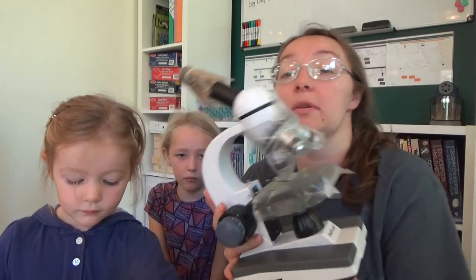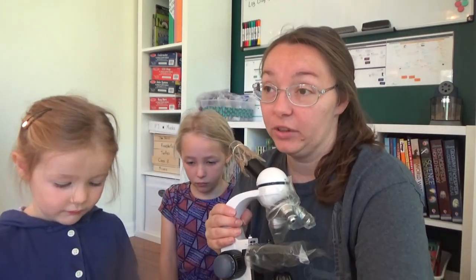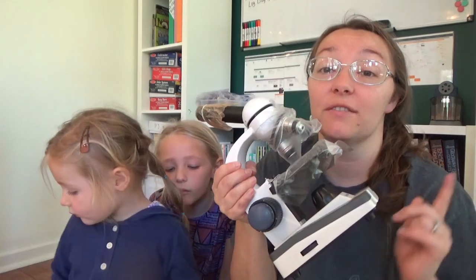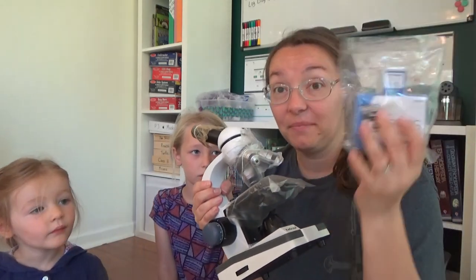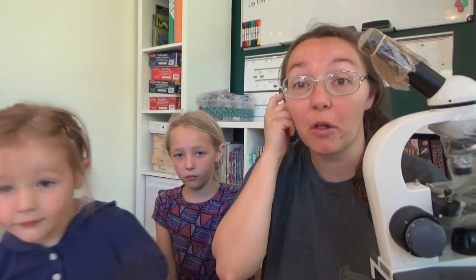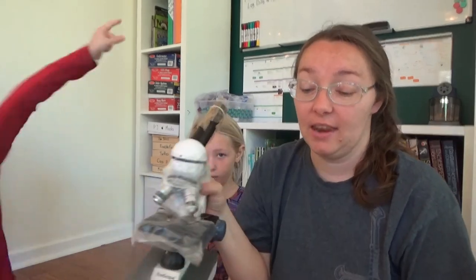We'll definitely be seeing just the intricacies of what God created in our world, and I am really excited to use this. Hopefully little hands can respect this as the piece of homeschool equipment that it is and not a toy. I'm really excited because in our science unit today we are going to go out and find flowers, put them on our slides, and look at the smaller parts of the flower under the microscope.